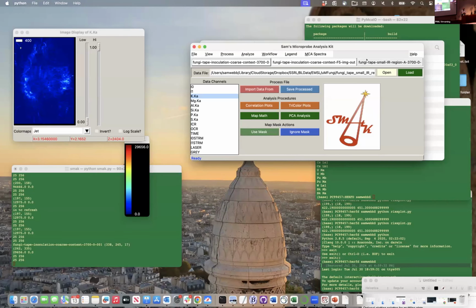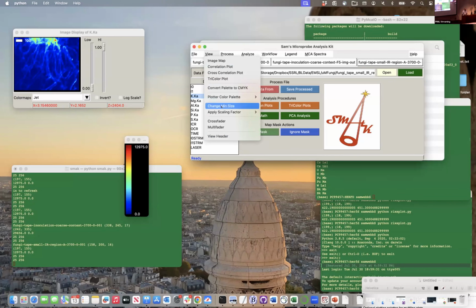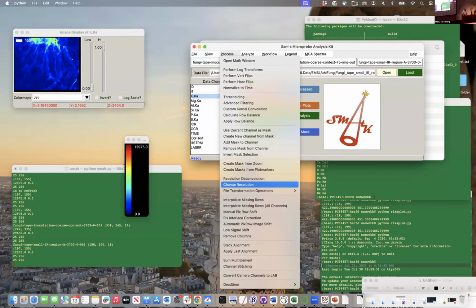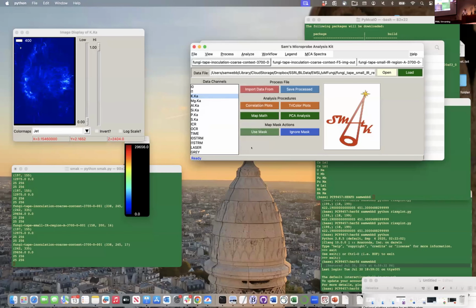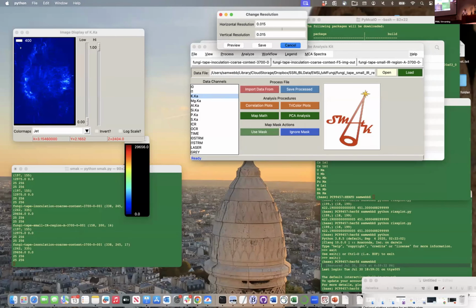We also need to worry about resolution now, too, because these are also collected at different resolutions. So if I take our imported map here, our small map that we want to import into, I can again look at the resolution here and see that that's at 5 microns. And so what I'm going to want to do is take my coarse data. I'm going to want to scale that to 5 microns now rather than 15. Of course, this is under my zoom bar now. I can still get to it.